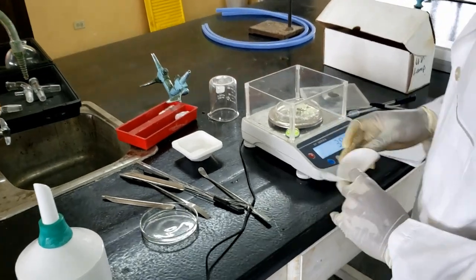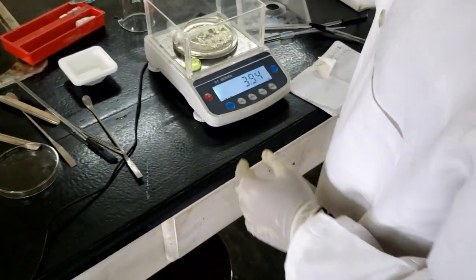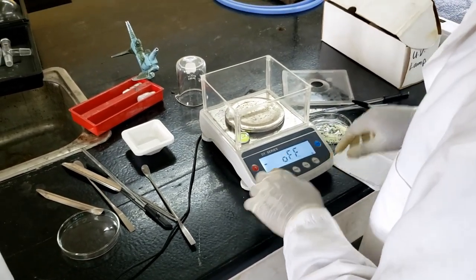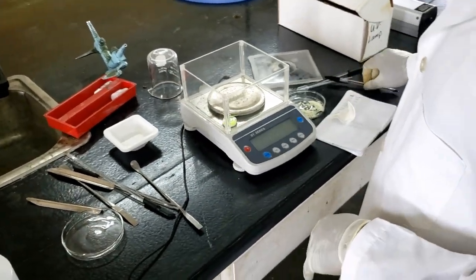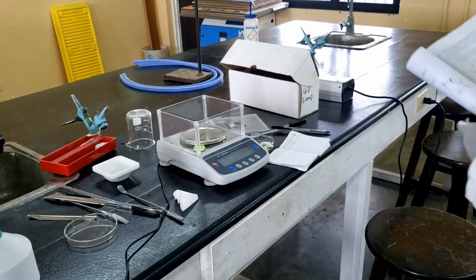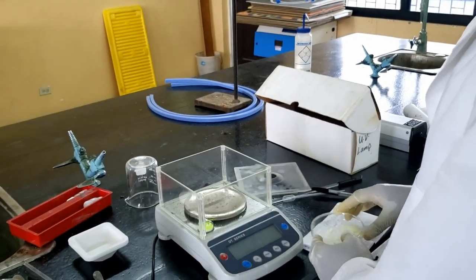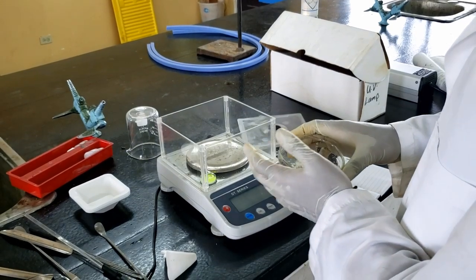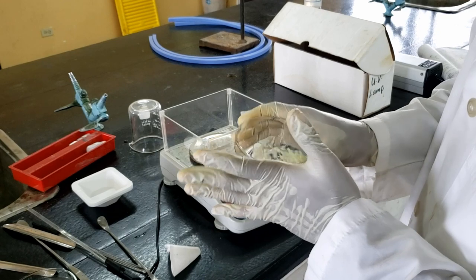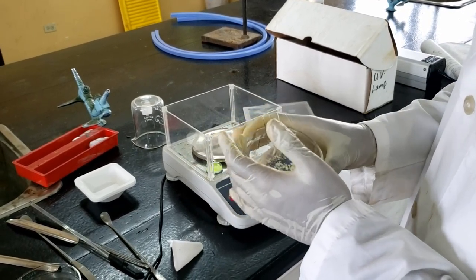Okay, so we collected 3.94 grams of bromonitrobenzene. Now for the next step, we're going to dissolve that in a matching amount of ethanol. So for every gram of bromonitrobenzene that we got is 1 ml of ethanol. So we're just going to use 4 ml of ethanol to dissolve this into a homogeneous solution, and then we'll recrystallize once more.